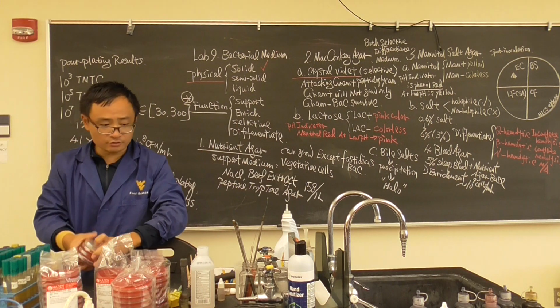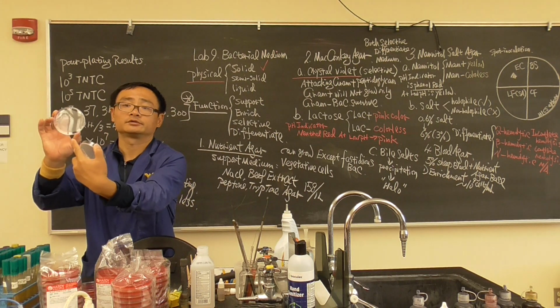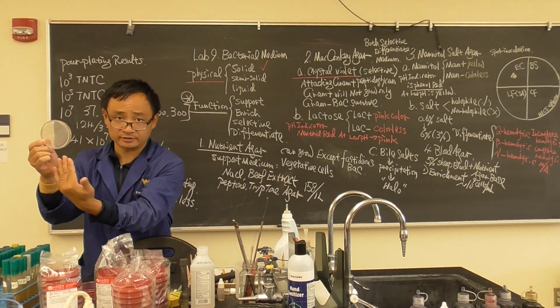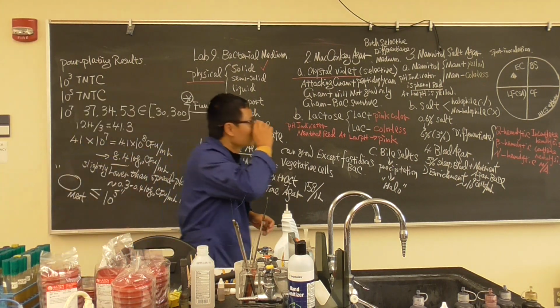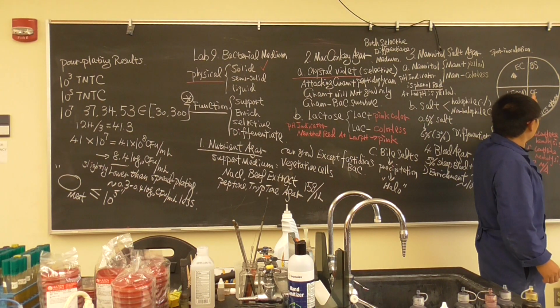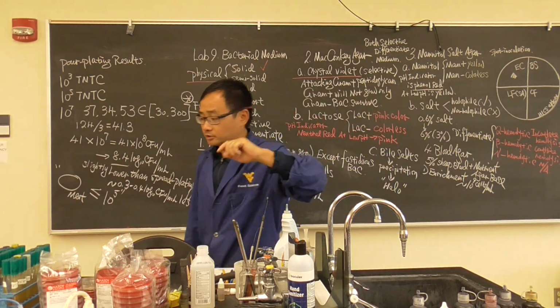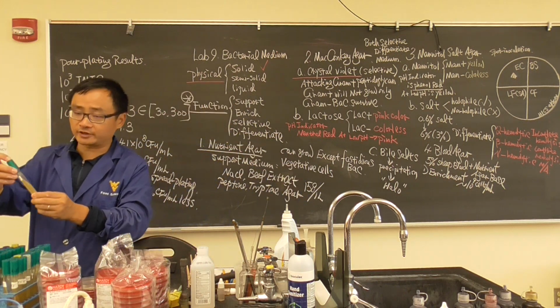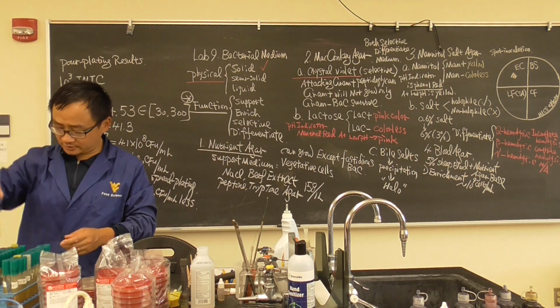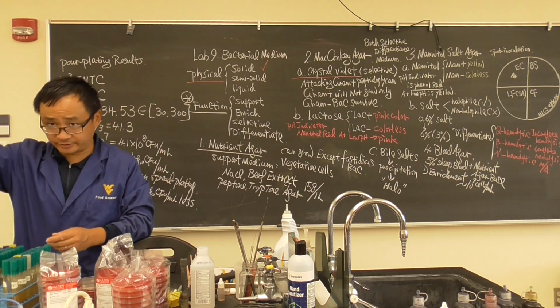Okay, when you have these ready, do not forget there is condensation inside. Make sure you use a paper towel to clean, and clean the back. Then start to label the back: put the 4 quadrants, write your name there, and write your bacteria initials. Then start to do the spot inoculation using a loop. Where are you going to inoculate from? From the slants. EC is E. coli, Bacillus is BS, LF is Lactobacillus fermentum, and Citrobacter.